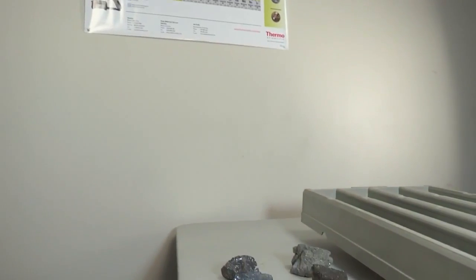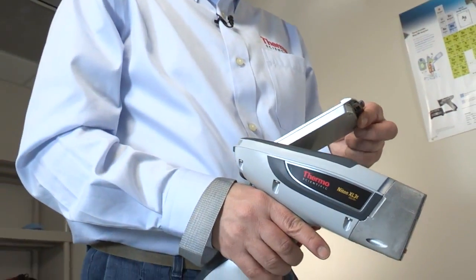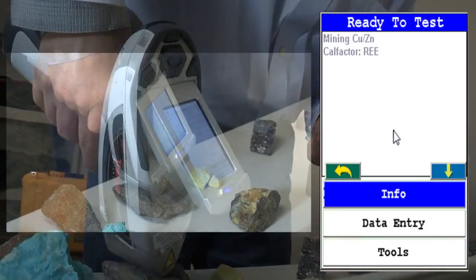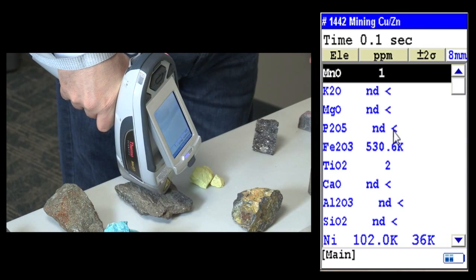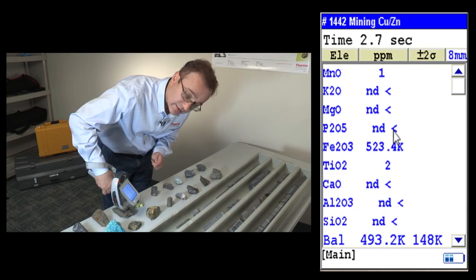Now, let me show you how you can use this on one of these samples that I have here. I can adjust the screen to view the area. It has the camera that shows the analyzed area. As long as the window is against the sample and you pull the trigger, you can analyze the sample.